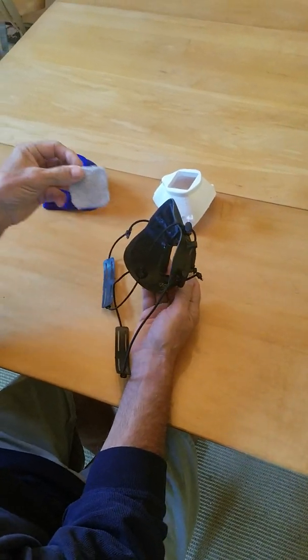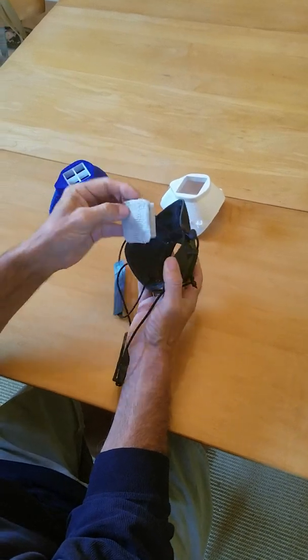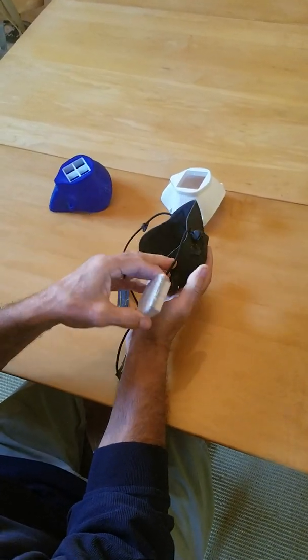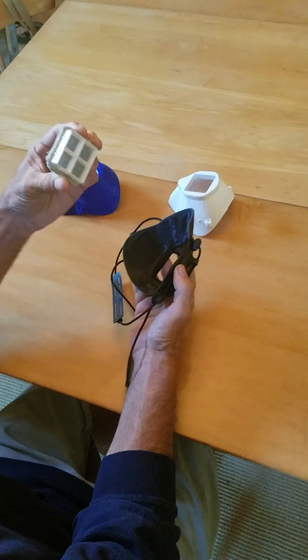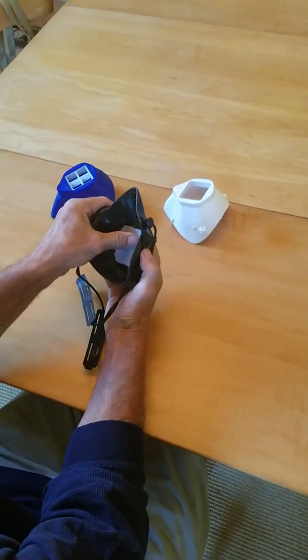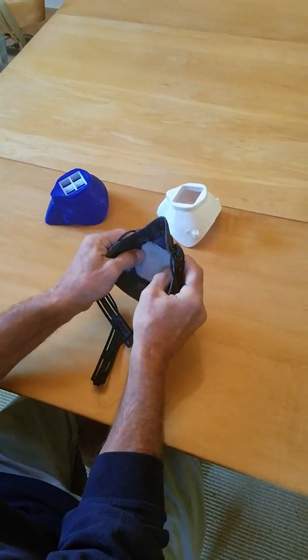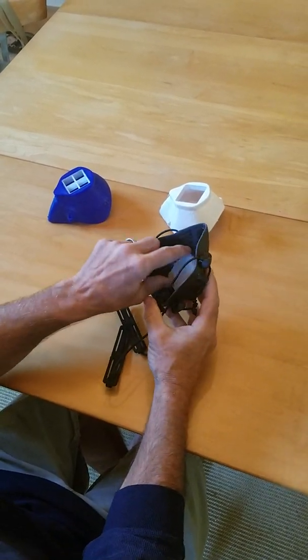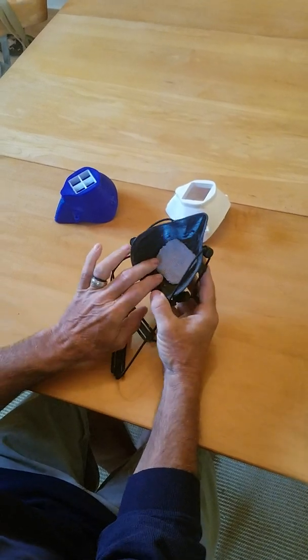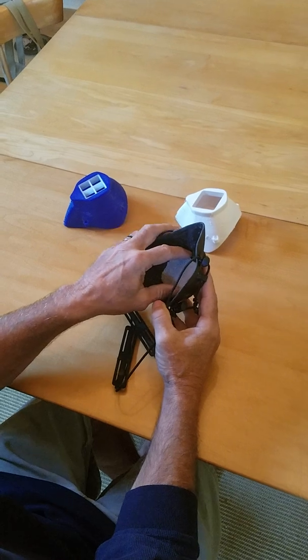Now, what's important about this cartridge is that the filter, which is microfiber, a couple layers of microfiber fabric, goes in this way. And it just, like I say, presses in like that. You get an extra cartridge with the mask so you can clean it off and wash it out and use the other cartridge while it's drying.